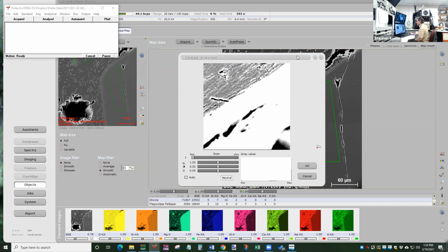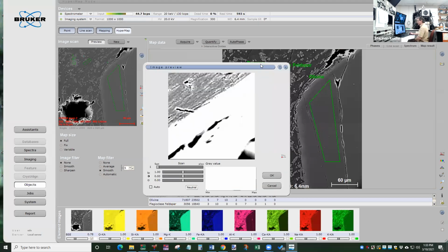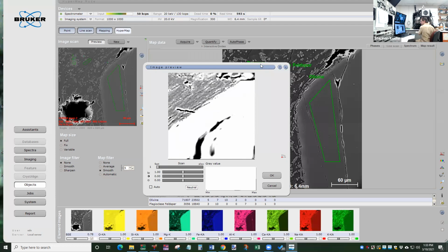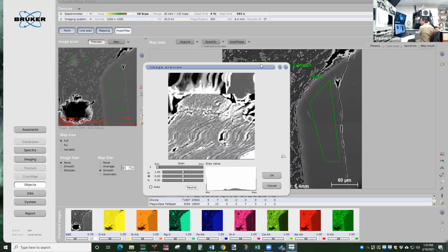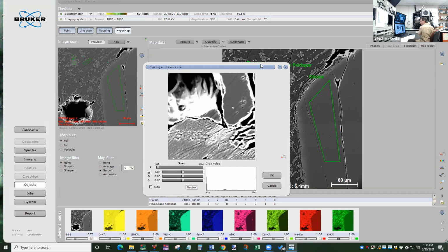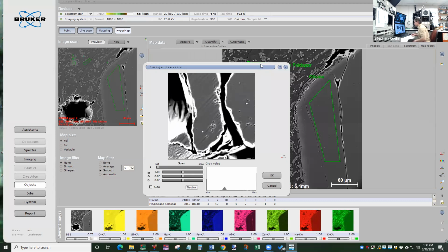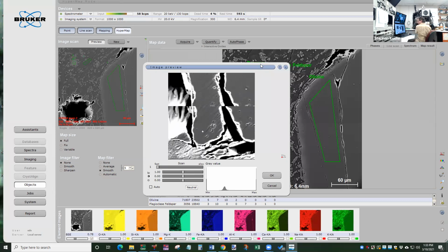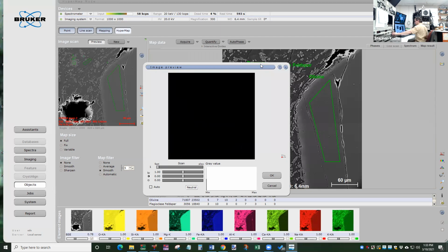Maybe that, actually that might be going off the edge. But that's what that is. I think that just went off the edge where there's no carbon film. Okay, we don't want that. So there's two things here. I think that was off the edge. Okay, I'm going to turn the contrast down a bit. I think this is too much.